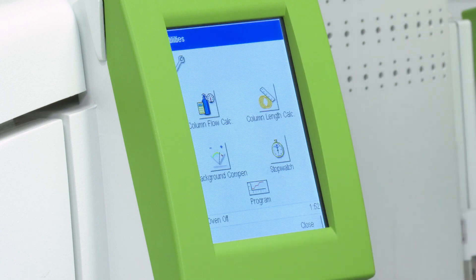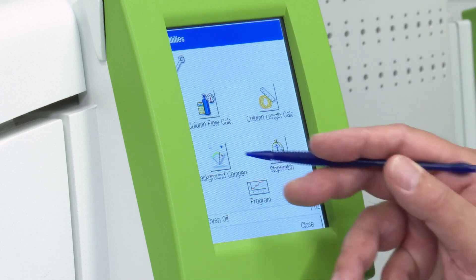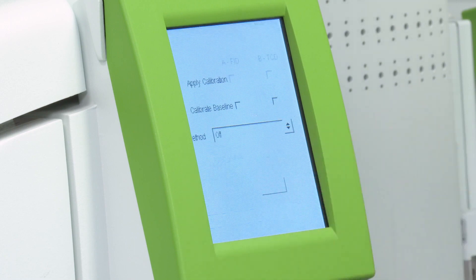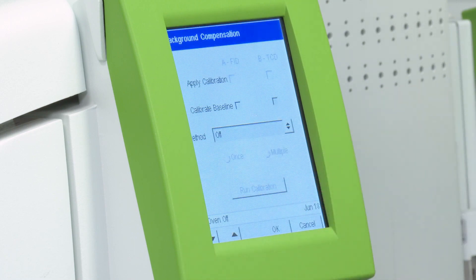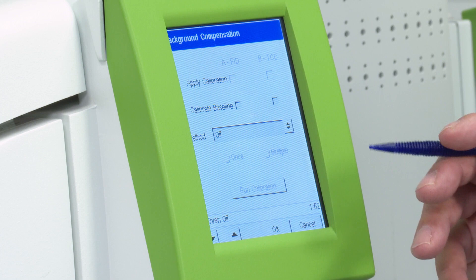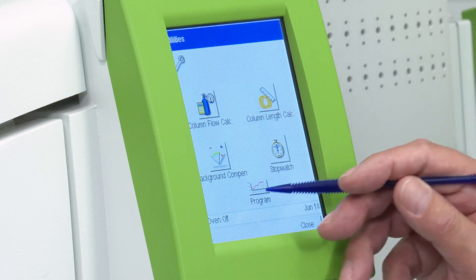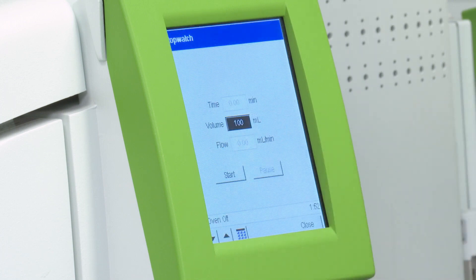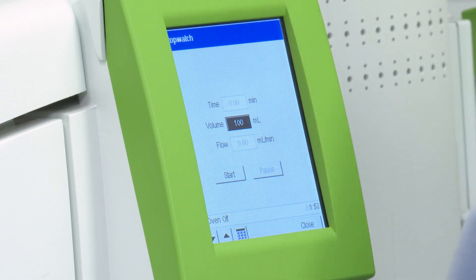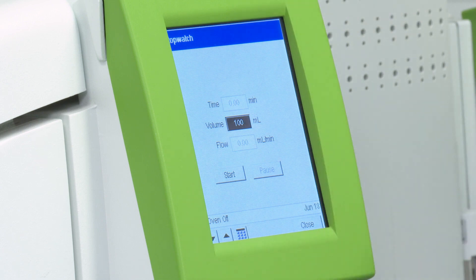There are a couple other utilities in there. One's called background compensation, which is occasionally used in petroleum/cam applications — not a lot of people will do it, but it's there if you need it. And then finally there's one called stopwatch. A few people still have old-fashioned bubble flow meters, and if you have one of those handy in your lab, you can utilize the stopwatch to get some flow information. So that's some of the useful utilities in the front panel.